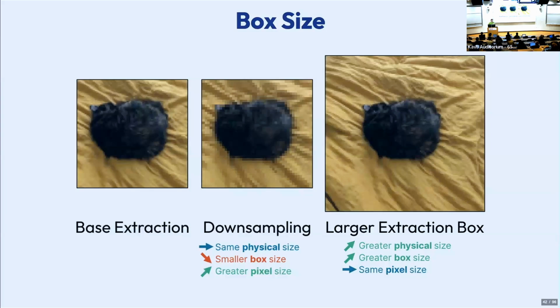And then when you're coming back through and re-extracting, you can either do full size, or if your particle is very big, you can pick a pixel size so that twice that pixel size is kind of a resolution you expect your map to hit. So maybe you'd extract at 1.5 angstrom pixel size if you wanted to get a 3 angstrom map.